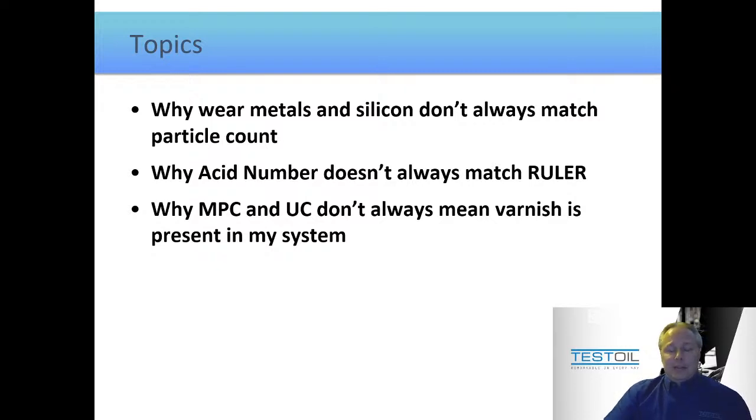Now, the simple answer to all of these is, generally speaking, they're maybe not meant to correlate. And the logic is quite simple: if you did two different tests that always directly correlated with each other, meaning that as long as one was high, the other one was high, or whichever direction they're going to go, there wouldn't be a lot of point doing both tests. So each test is meant to test something specific or see it from a specific viewpoint. So that's mostly what we'll be seeing here. So without further ado, here's our first example.